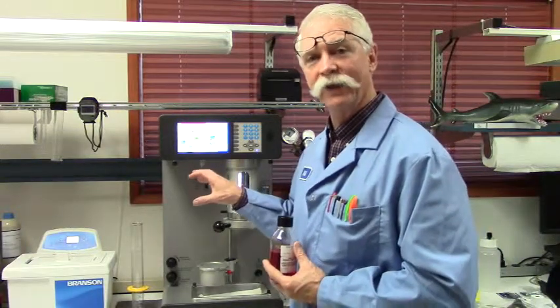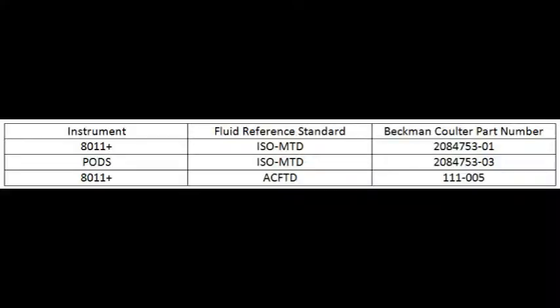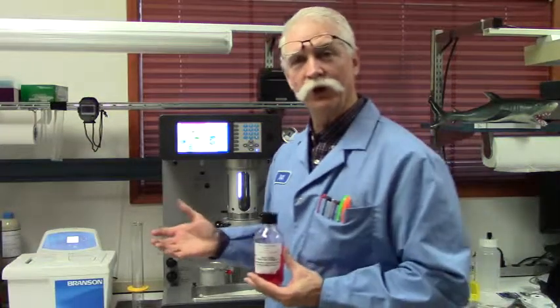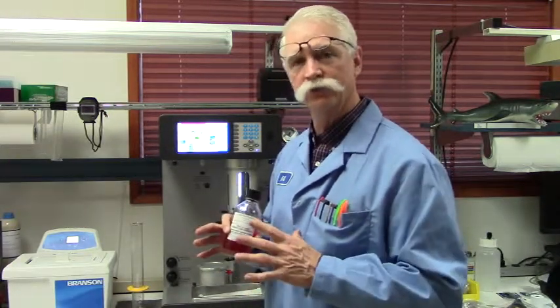Now that the instrument is set up properly and we've selected the correct calibration type, we're going to select the correct reference fluid type, which is iso-medium test dust. The part numbers are listed on the screen for your convenience. The first thing we want to do is take the fluid and put it into the ultrasonic bath to disperse the particles within the fluid.